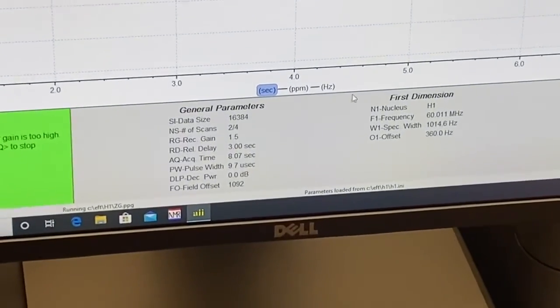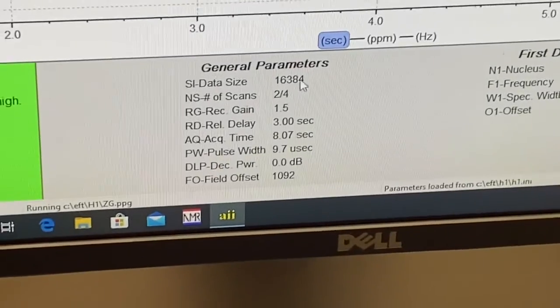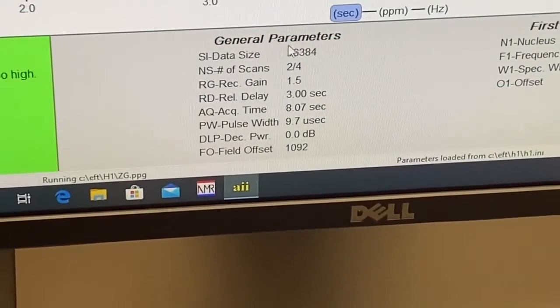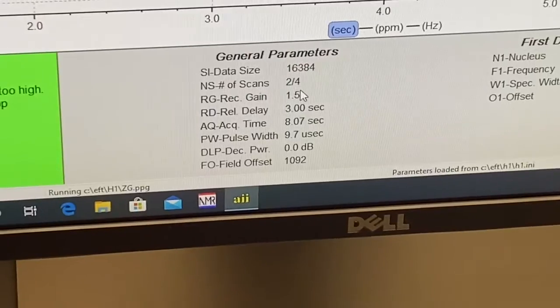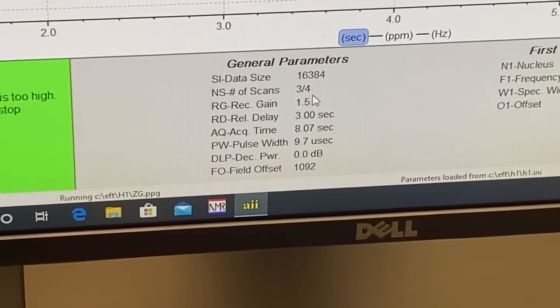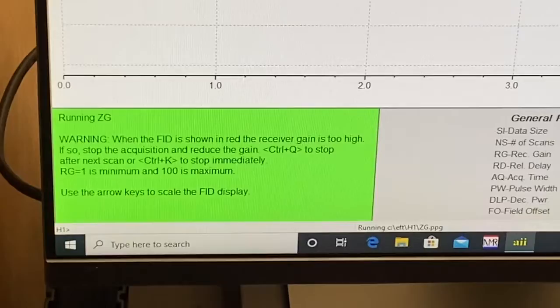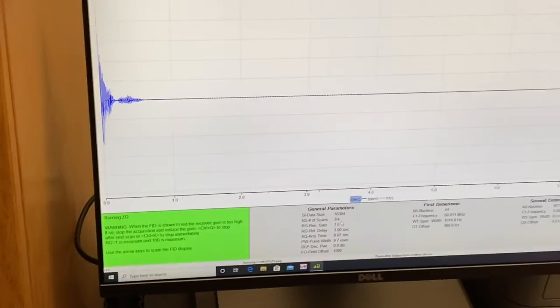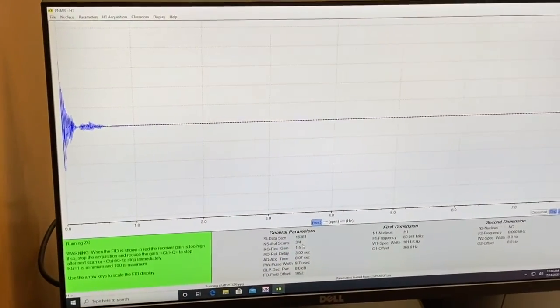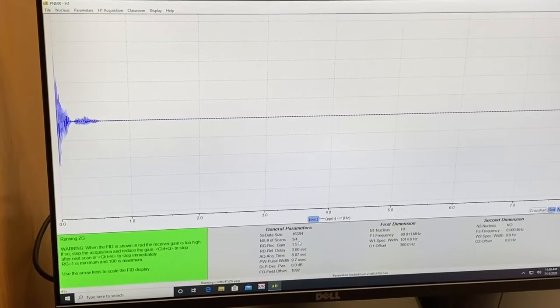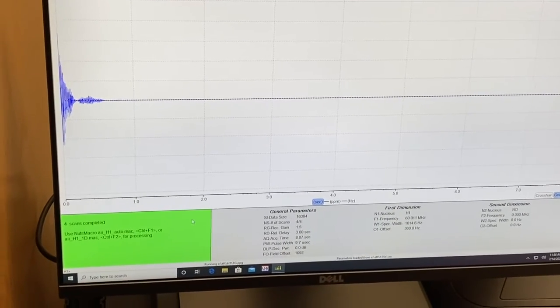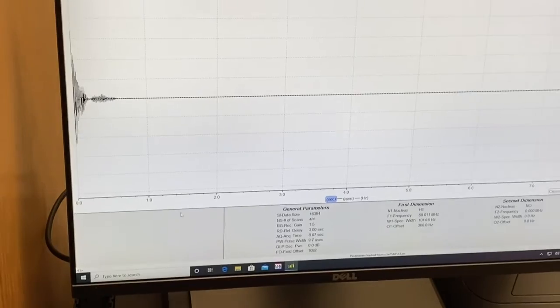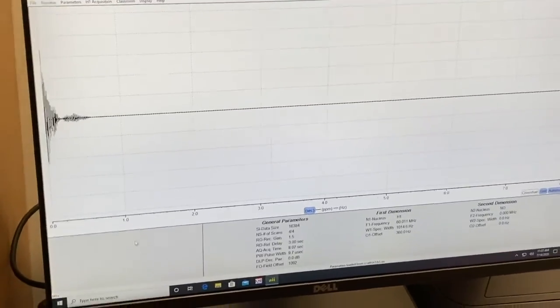You can see the scans counting down on the screen. Right now it's two of four and then it should change when it's done to three of four. When it goes four or four, that green box will go away. OK, it's got its four scans.